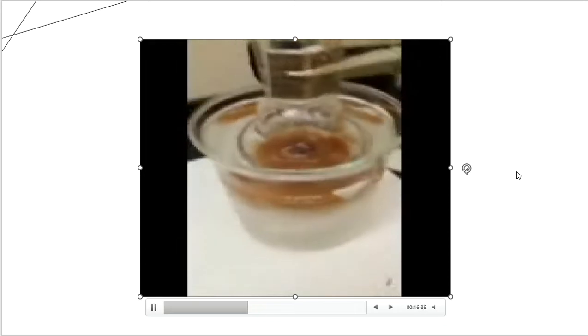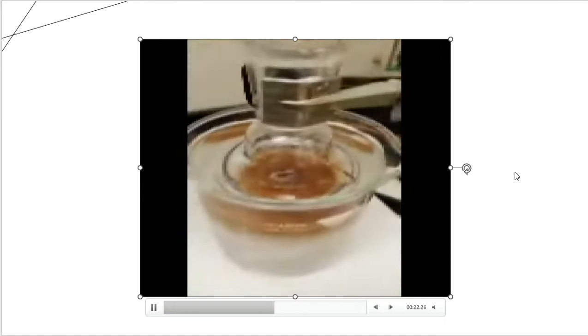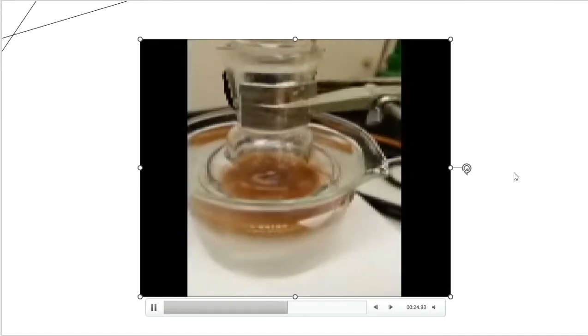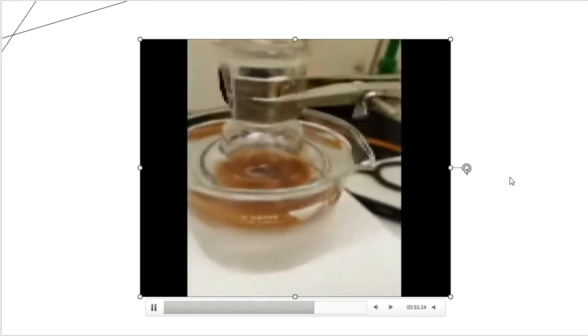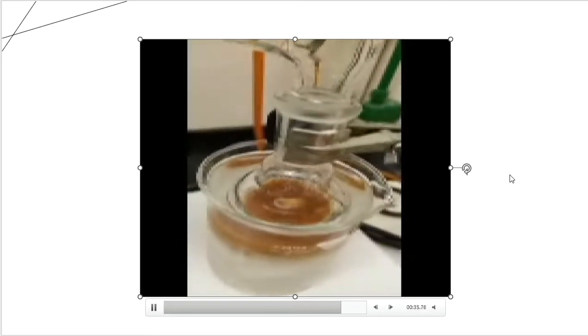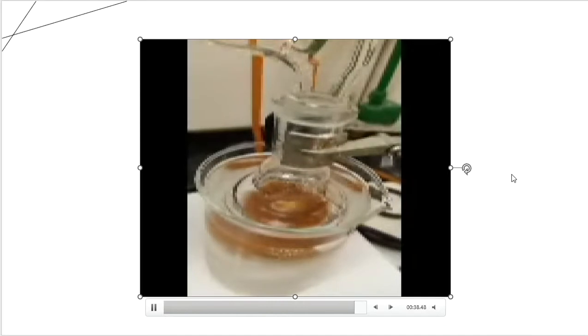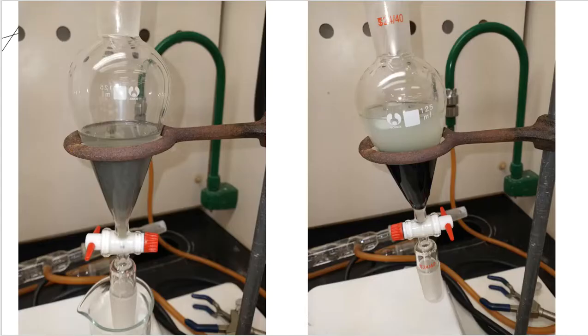We took what was inside that boiling flask, and we went back and added more aluminum chloride that we had dehydrated. We had put it into an oven and completely driven off the water. We had made sure that this was really activated aluminum chloride. And we went back to that point and began refluxing all over again. We were adding the acetic anhydride and the aluminum chloride, and we started to see observational changes. It became more orangey, more brown at that part of the reaction, and then we got to the separatory funnel step, and that looked different as well.